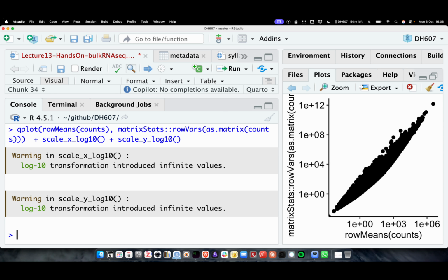Is there anything that is not clear right now? Is the problem clear? In Gaussian, whenever you do a t-test, z-test, whatever, there's an inherent assumption that there is a mu and a sigma square. This is your mu, and this is a measure of sigma square. If my genes follow a Gaussian distribution, that sigma square can be anything. It's not constrained by what my mu is. This mu could have been higher, and I could still have got that sigma square. So if your genes are following a Gaussian distribution, and you plot this curve, what curve will you get?